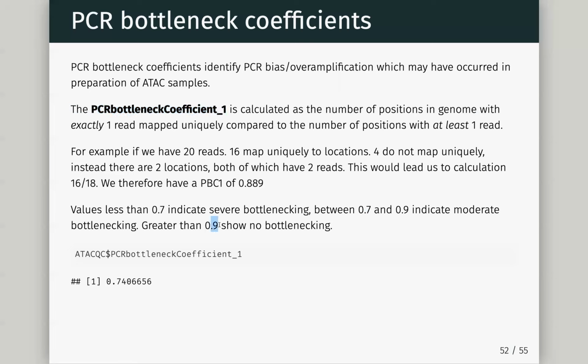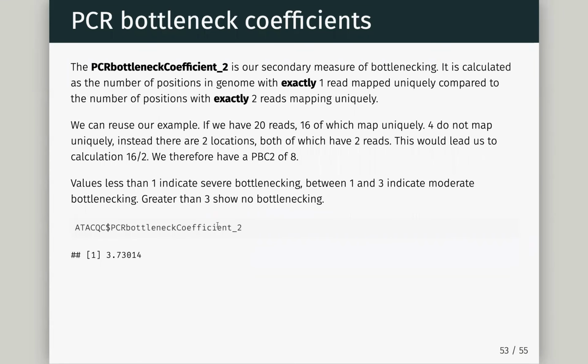Most of the time, and this is ENCODE data, you can see it's very close. Most of the time with your data nowadays, you'll be quite high, a lot higher. And without slagging ENCODE, ENCODE got there first. So they were doing these methods when they were still developing. So a lot of their quality metrics are quite low.